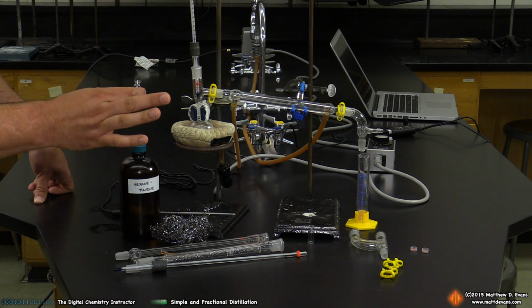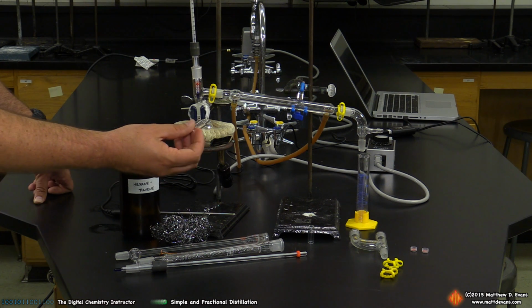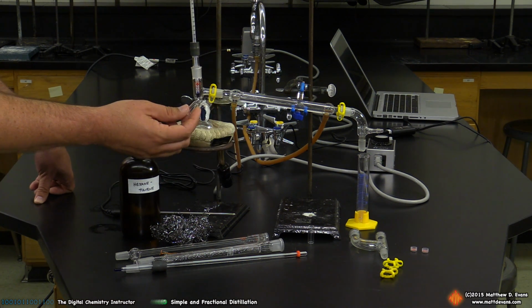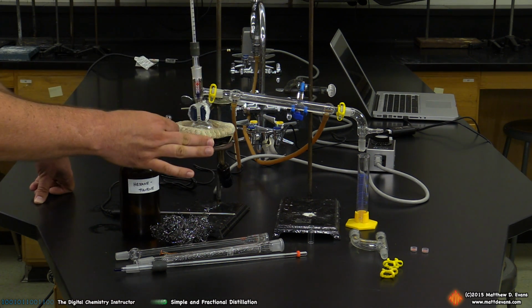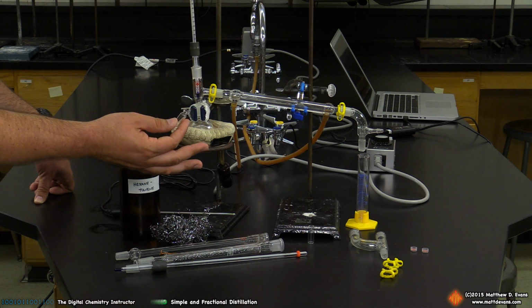So we're doing a couple things here. We're not only identifying the components of the mixture, yours is truly an unknown, but we're also going to see how pure we can get these components by distillation, both simple distillation and also fractional distillation. We expect better results from fractional distillation.